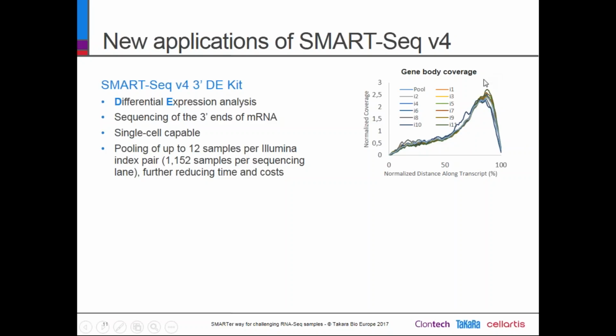You can see here that as compared to the image that I showed before, the coverage is only on the 3' end side. This, of course, will allow you to do differential expression at the single cell level at a lower cost.